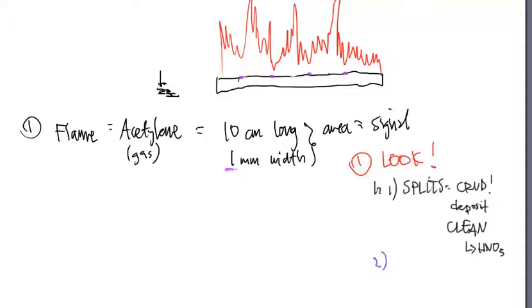The second thing that you want to look for is blue. Okay? So when it concerns the blue color, what you're after here is a blue color that sits at the base of this flame. Right here on the very top of this flame is going to be the hottest part. And that blue color better be very uniform all the way at the bottom.